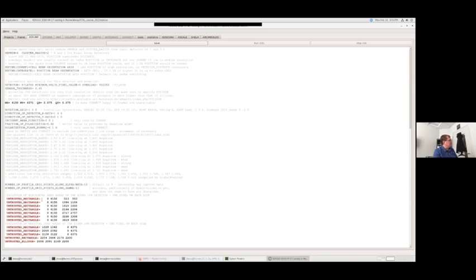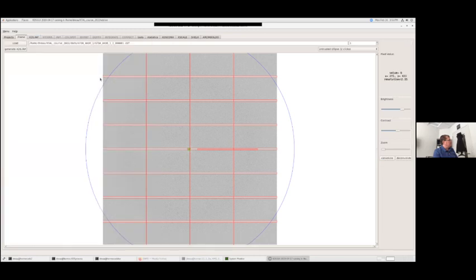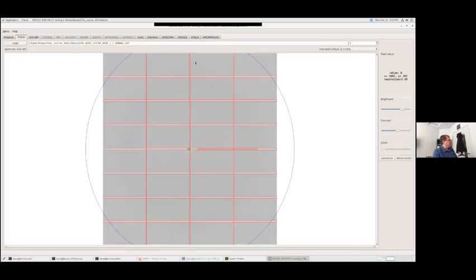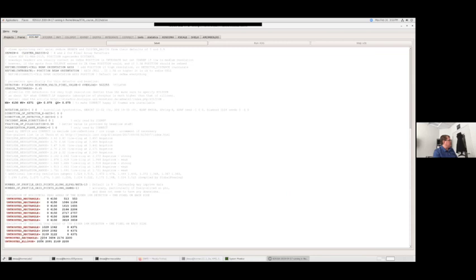So you can think of this in the X direction and the Y direction. So these rectangles up here are these long ones here that go from 0, which is the left side of the detector, to 4150, which is the right side, and then some span of the Y direction. And then we have three vertical here. That's these vertical ones. And then these extra ones are the rectangle and the ellipse that I drew in on the detector face. Okay.